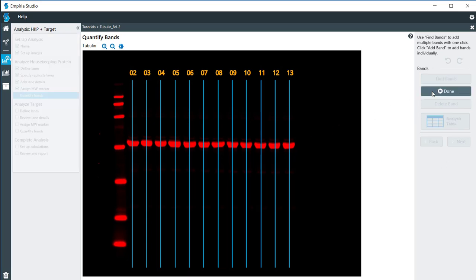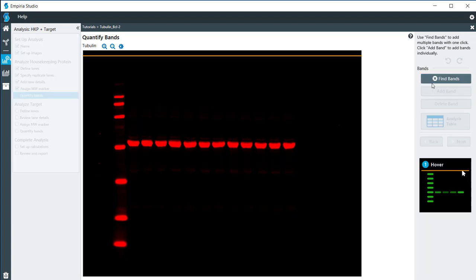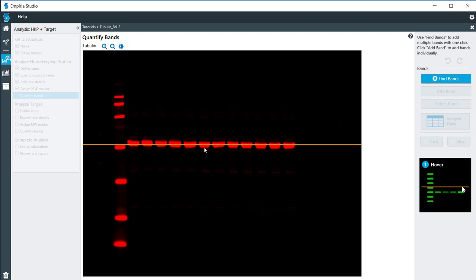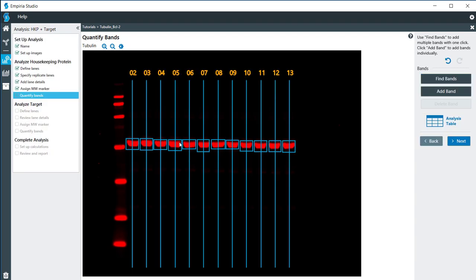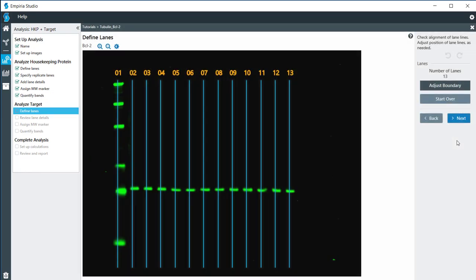I can either click on the add band and add these markers individually, or if I click on the find bands, I can move this line into the proper location and do a single click, and it will determine the size and location of the boxes for me. You can also adjust these, the height, the width, and overall location of them. But everything looks okay here, so I'm going to click on next.